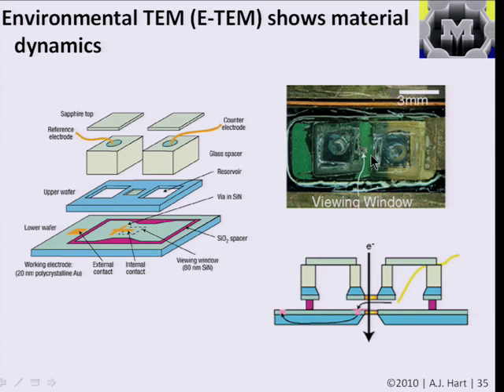And relating to this idea of hooking things to wires and taking other types of measurements while you're taking pictures, there's also a lot of research on doing other things while you're taking images in an electron microscope. And like environmental SEM, there's also environmental TEM. And this is also quite a sophisticated technique, but I just wanted to show you one example of this where researchers want to view dynamic processes inside a TEM.